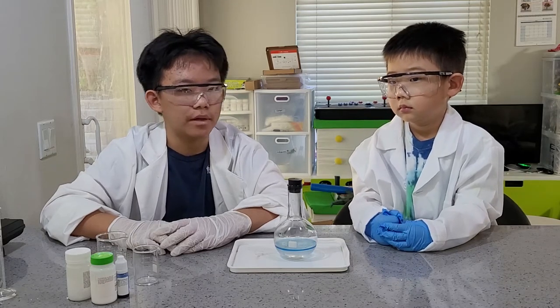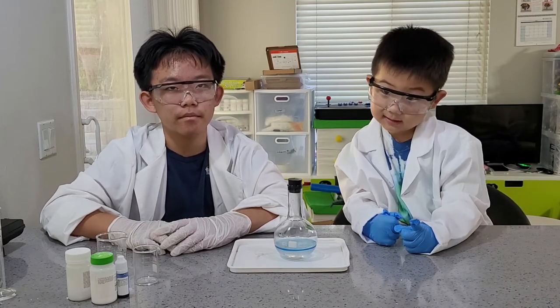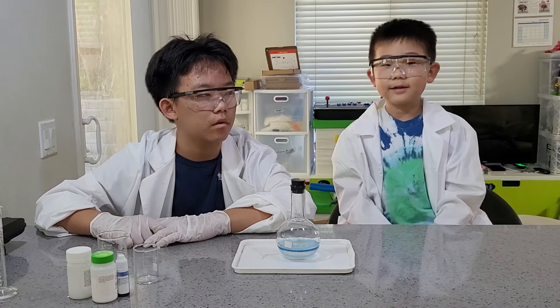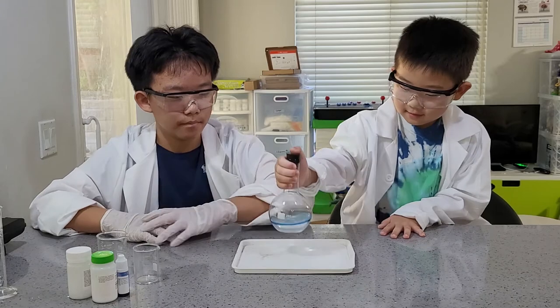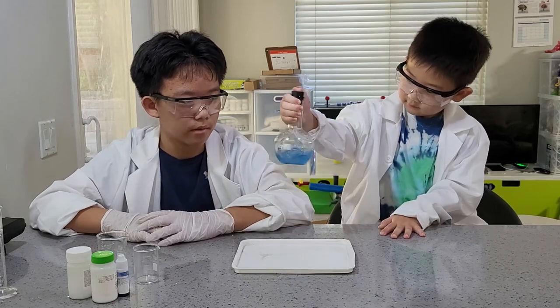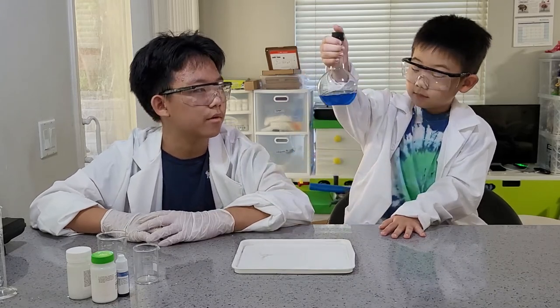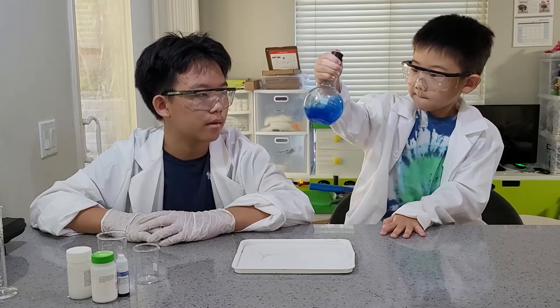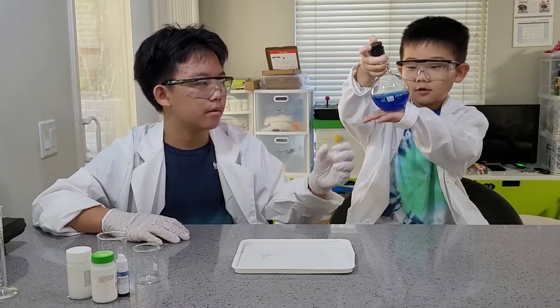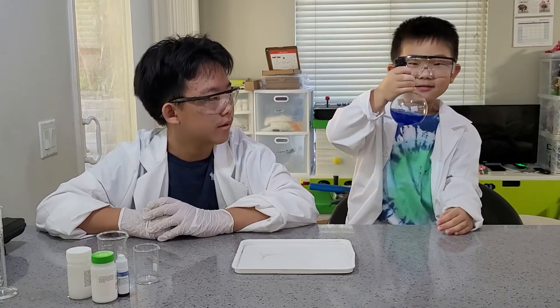Ready for some magic again? Yes! Are you guys ready for one more magic? It's redox reaction time. Science magic. Now it's blue again. Magic!